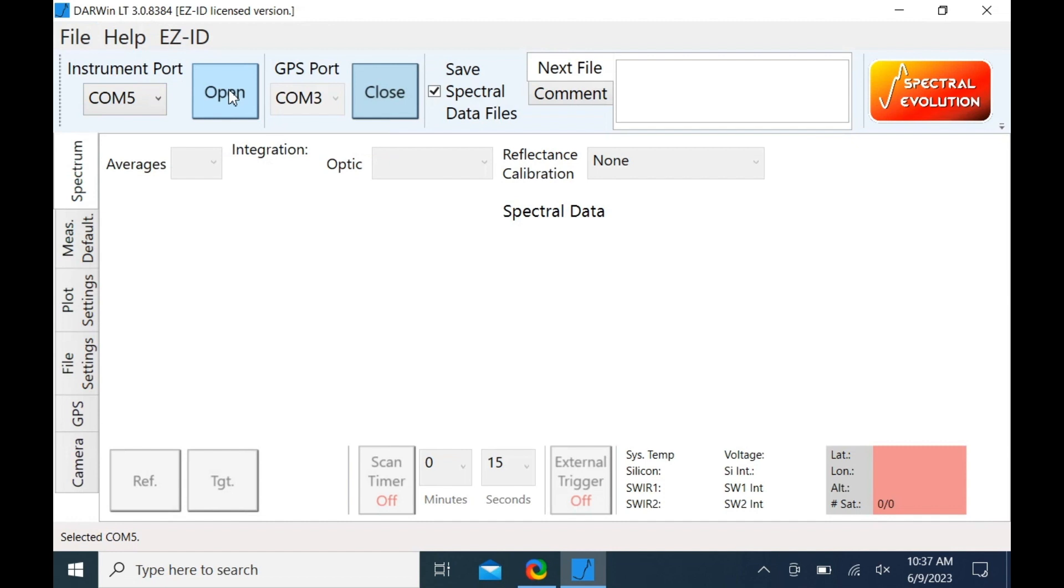Your instrument details should now be loaded. The system is now ready for acquisition.